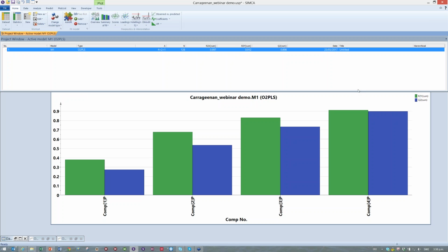Here we now see the project window. We have information on the model, and I will now show you how you can change the model title. I'm changing the model title, NIR versus Y block, for instance. And remember, as I told you, that this information will be part of the naming structure. It will be reproduced when naming the hierarchical models.